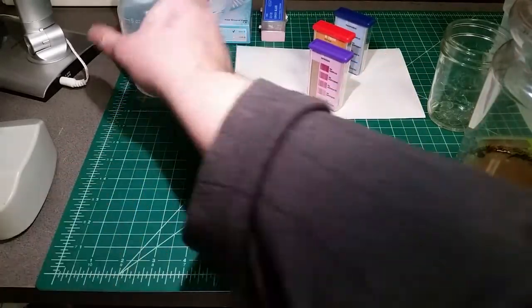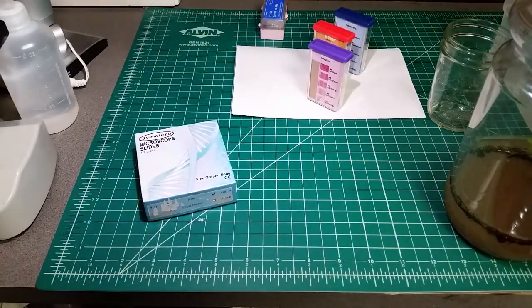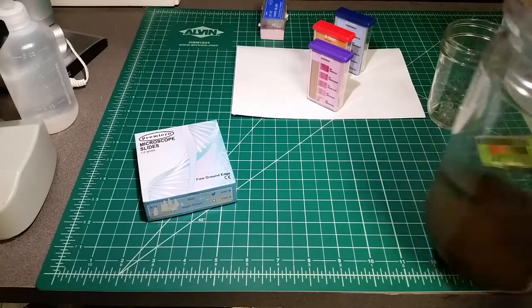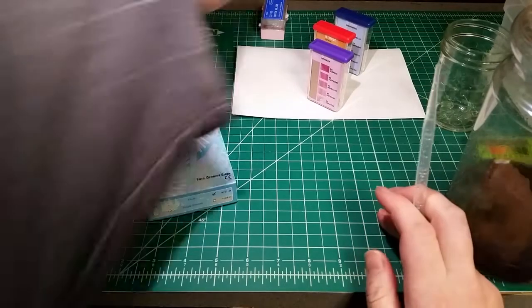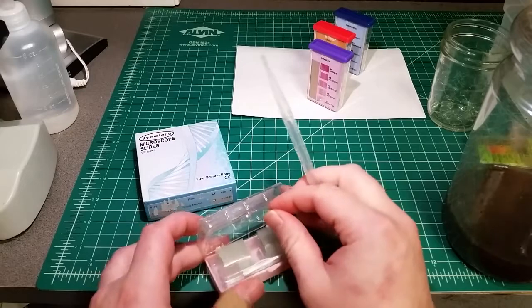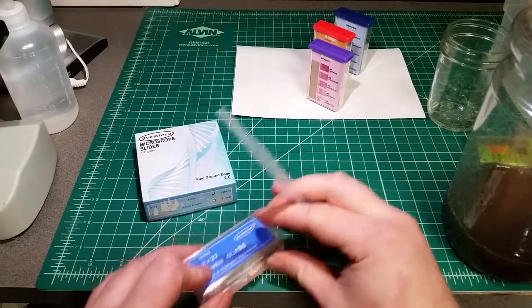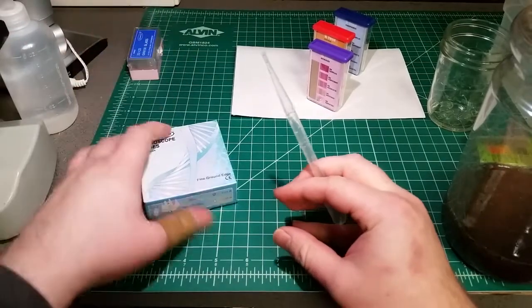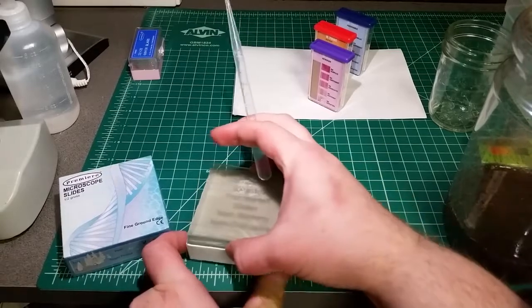In the meantime, we're going to prepare our slide. For this, I want to get some of the lightest aggregates rather than being careful with the fluid. We'll mix up the solution again, grab a cover slip, and a fresh slide.